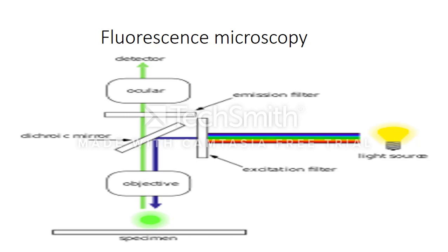So this is also considered wide field microscopy, and this is used if you want to see a particular organelle or protein. So in this case, we use fluorochromes, and they allow us to look at details of the cell with better resolution. We can also see cell movements and isolate between things we want to see.